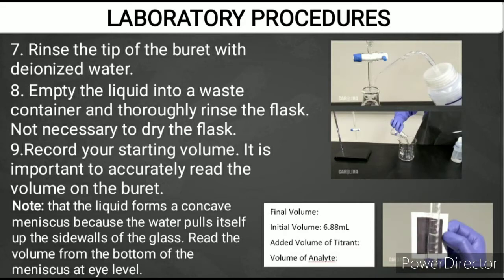Procedure number 7. Rinse the tip of the burette with deionized water. Procedure number 8. Empty the liquid into a waste container and thoroughly rinse the flask. Not necessary to dry the flask.